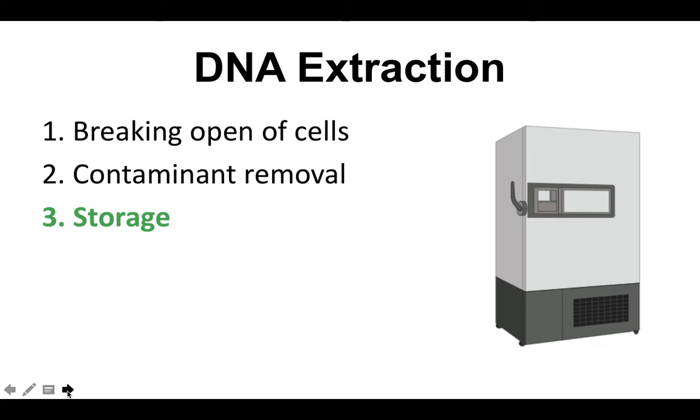It's very important that you keep DNA in that kind of preparation if you want to use it long term, like 2 to 6 months. But if you're going to use your extracted DNA within a week or a month, negative 20 or 4 degrees Celsius is actually a working temperature condition already.